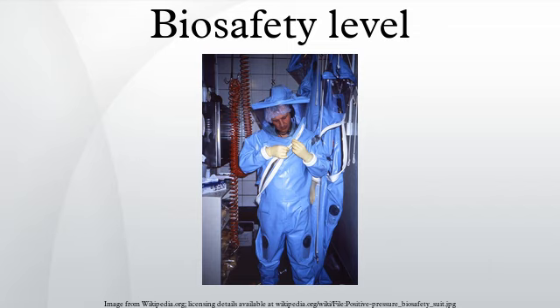The laboratory is not necessarily separated from the general traffic patterns in the building. Work is generally conducted on open benchtops using standard microbiological practices. Usually, contaminated materials are left in open waste receptacles. Decontamination procedures for this level are similar in most respects to modern precautions against everyday microorganisms. In a lab environment, all materials used for cell and/or bacteria cultures are decontaminated via autoclave.